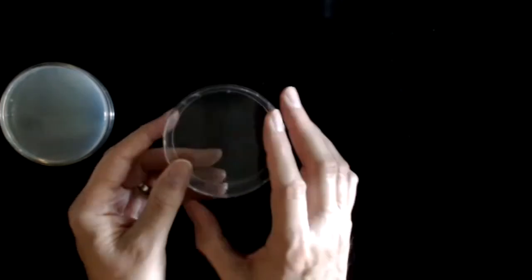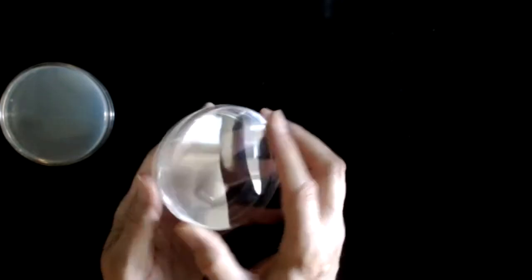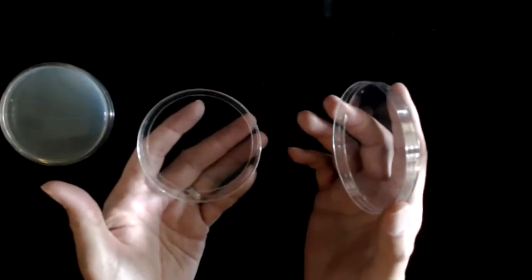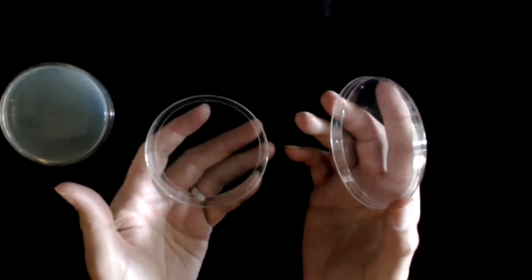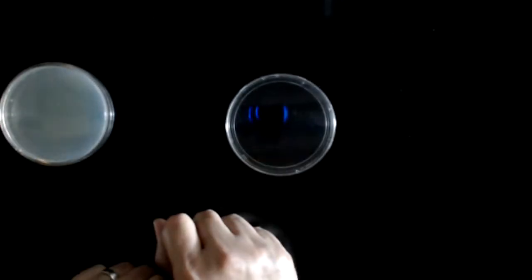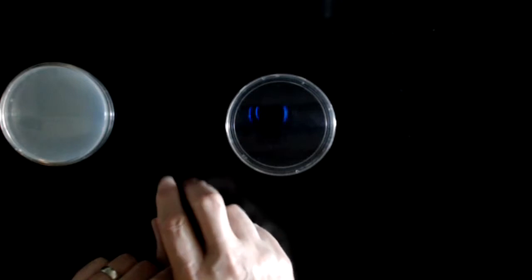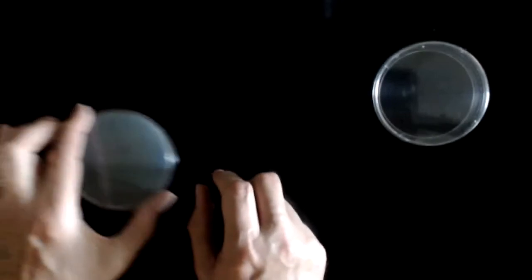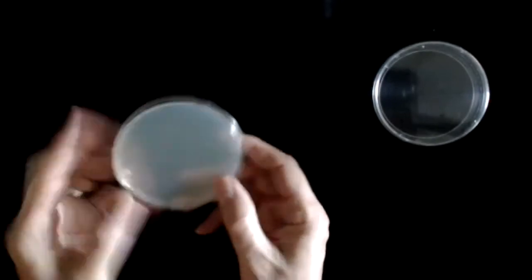In order to make this an agar plate, we have to pour a solidifying substance into the bottom section of the plate. We do this, of course, by taking the top off and then pouring a suspension or a solution that is liquid into the bottom portion, put the top on, and then allow that solution or suspension to harden, become solid in the bottom of the plate. Once the substance has solidified in the bottom of the plate, it'll look like this.